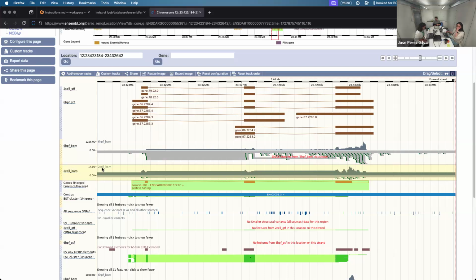Now, these results you have to take with some care, because for these results, in terms of expression, to be truly significant, you need to have some, oh, sorry, I'm missing the word in English. Some control that you know is quite ubiquitously expressed. Actin, I think, is one of the most used for this. And you need to normalize your levels when compared to that actin level, okay? I don't know if I made sense. I hope I did.